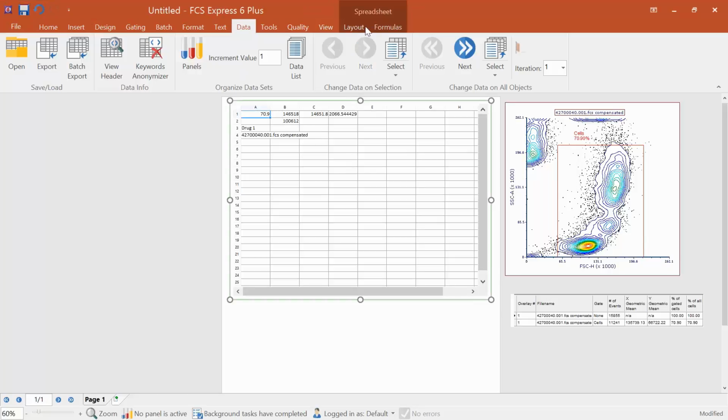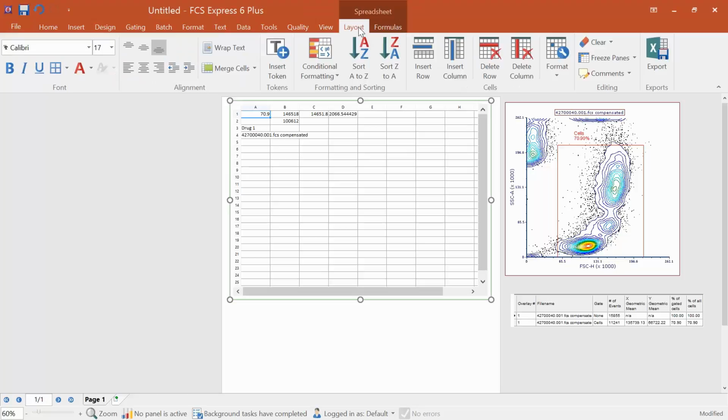Now we did discuss the layout tab just in passing, but you can remember that in the layout tab in Excel, you can do things like merge cells. So if this file name is a little long for one cell, of course we can come in here and merge that. You can see it's now one cell that's been concatenated with the 3.